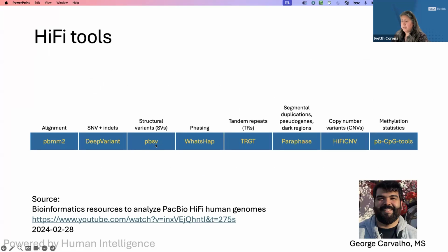With the PBSV, we get the variant calls, basically a VCF, and then we load it into VS Clinical, which is the VarSeq from Golden Helix, and try to use that for filtering. However, as I mentioned, using our normal pipeline that we would use with short read, it's just retrieving thousands of variants that couldn't be filtered out.